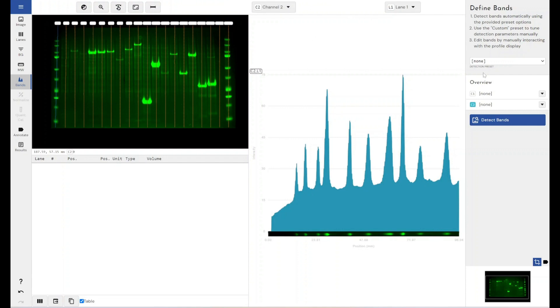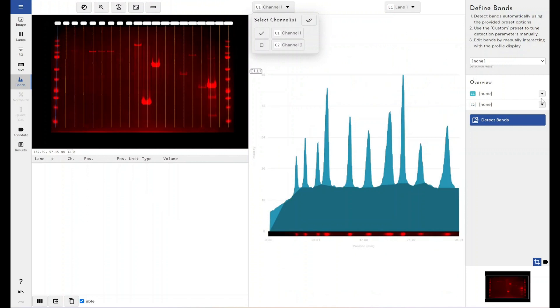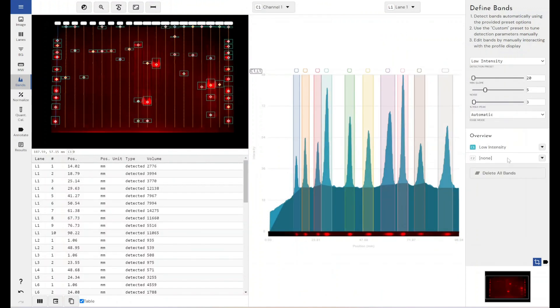And we've got a similar mechanism in place for the automatic band detection parameters. So again, we can change the sensitivity of the automatic band detection parameters per channel. We can use just low intensity on one channel and a high intensity on another channel. And again, this is to be used when you're kind of using different antibodies of different sensitivity. One may produce very intense bands for which you would use a low intensity detection preset and one may produce very faint bands for which you'd obviously need to use the high intensity preset.